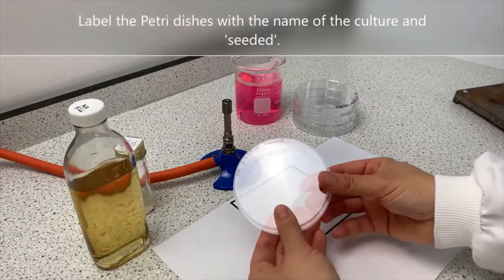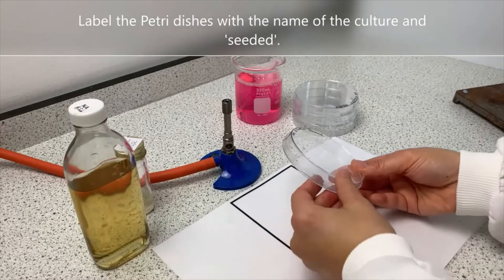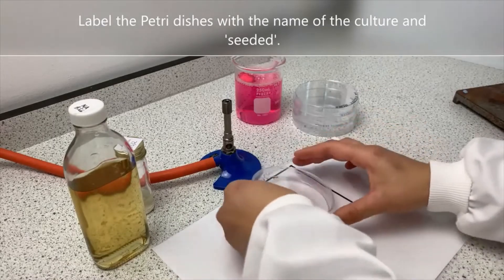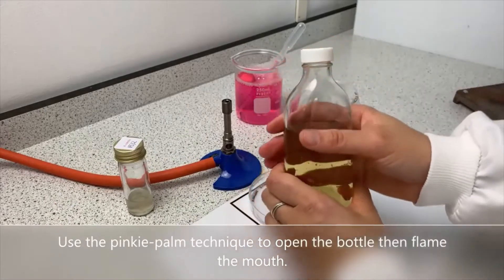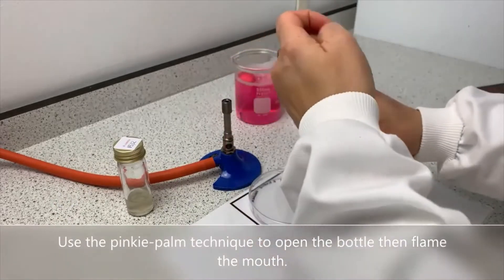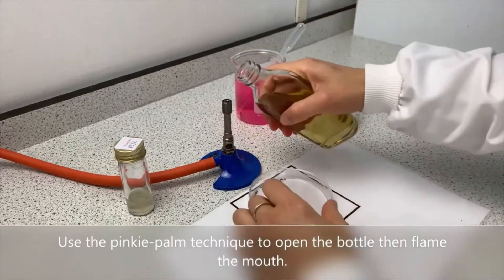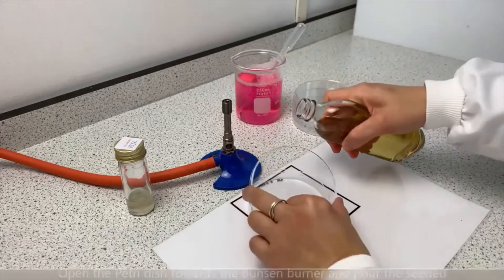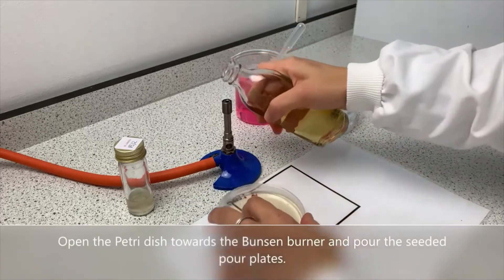Label the petri dishes with the name of the culture and 'seeded'. Use the pinky palm technique to open the bottle, then flame the mouth. Open the petri dish towards the Bunsen burner and pour the seeded pour plates.